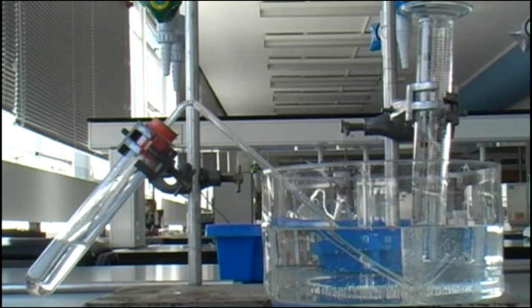Many chemical reactions lead to the formation of products which are gases. Collecting the gas produced can be quite challenging. The image on the screen shows how we can set up some common lab equipment to collect a gas using upward delivery over water.